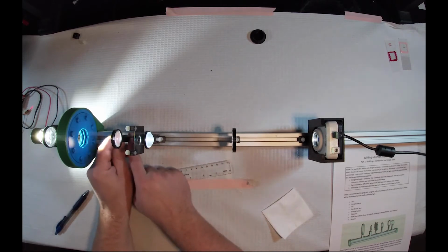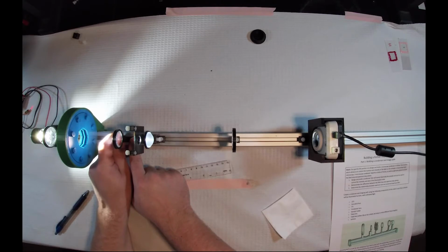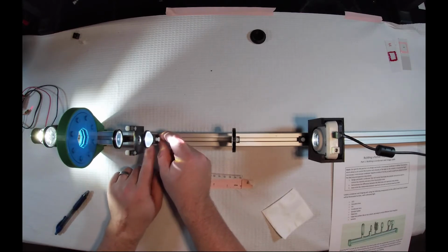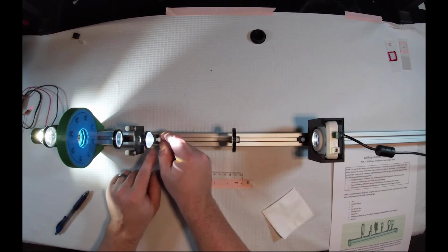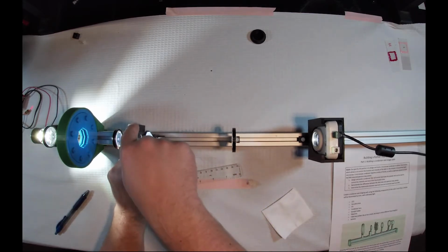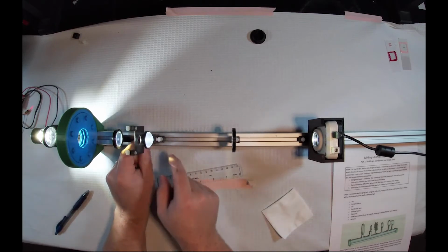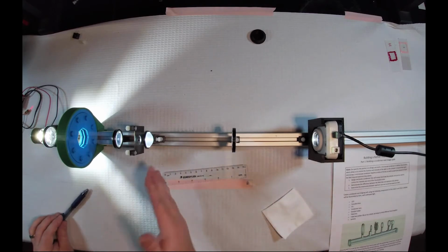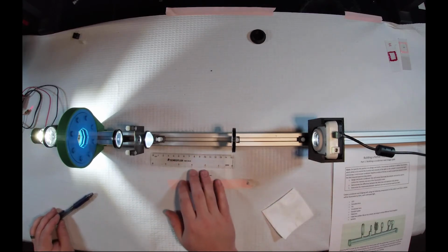I'm going to lock these down, but not permanently, because we will sort of need to slide them and adjust as we make the final adjustments. All right, so objective lens is roughly 20 millimeters away.